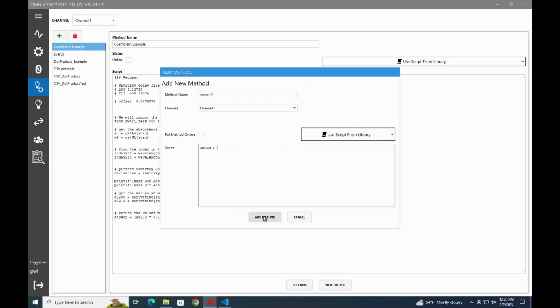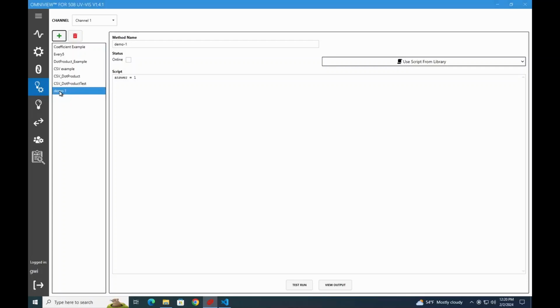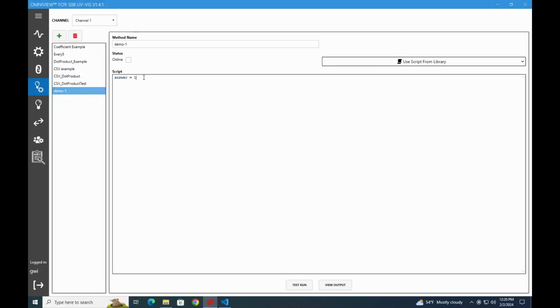We're going to add this method to our list. You'll see it come up in our list now. And you can see the script that we have here. Now, again, this is editable. I can change the script here if I want. But for right now, I want to show you how to test run the script. So I'm going to click the test run button here in a second.